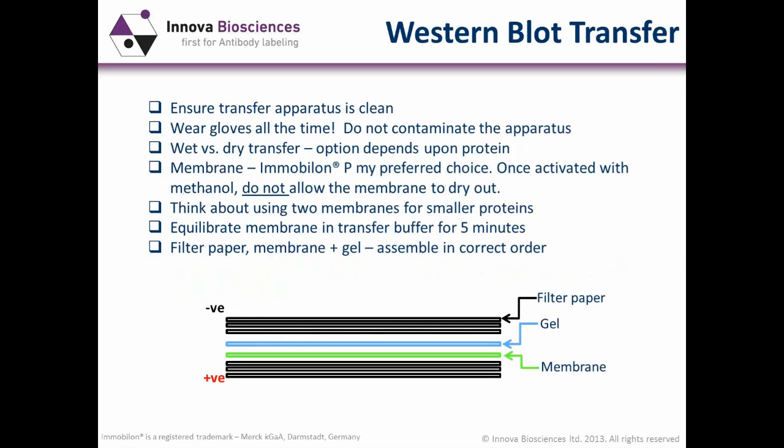Again, the Western blot transfer can be a very difficult step to optimize. It needs a lot of time and a lot of effort to get it right. But if you're smart and you follow a few guidelines, I'm sure you'll not struggle for too long. One of the things I can't stress enough: ensure your transfer apparatus is clean.